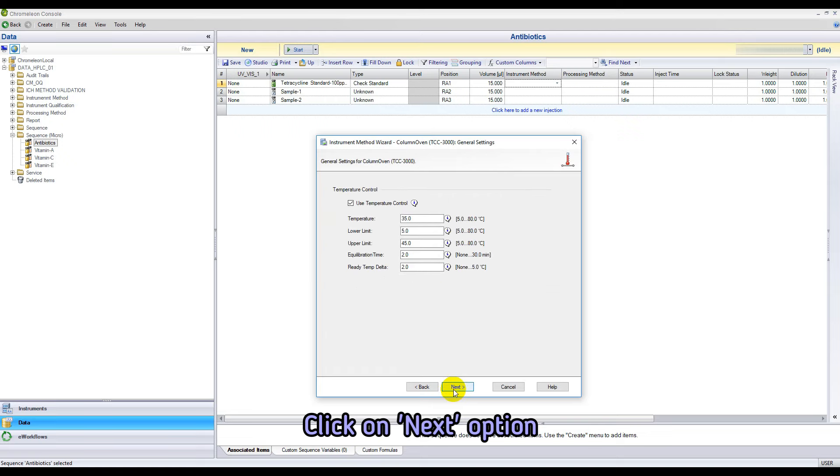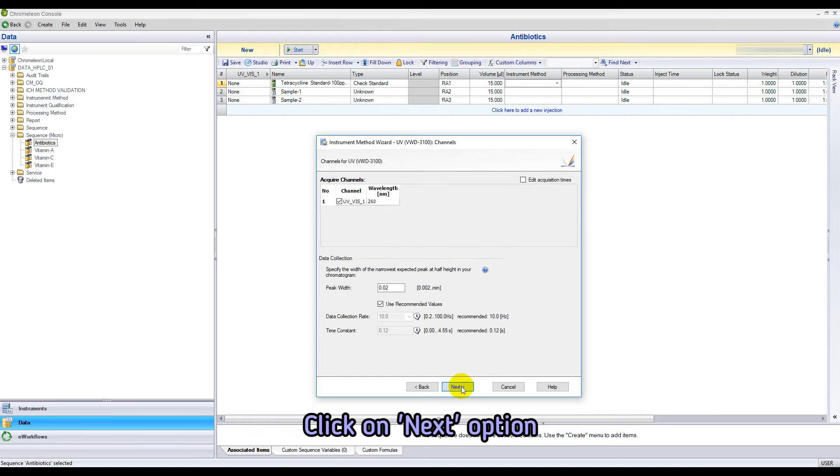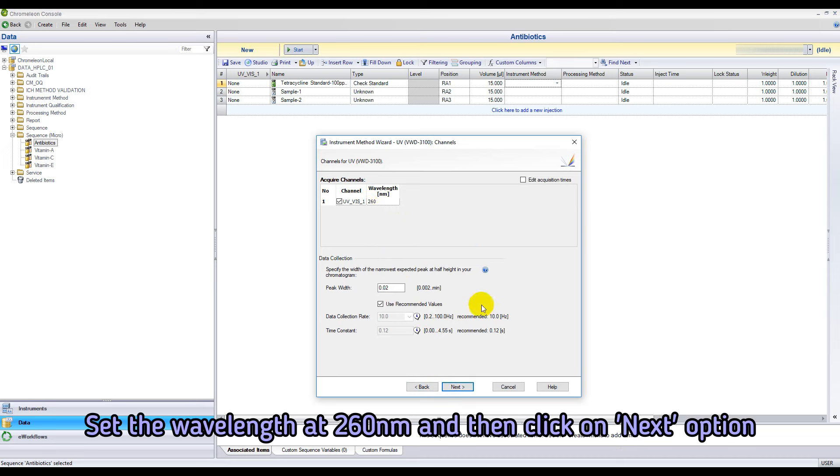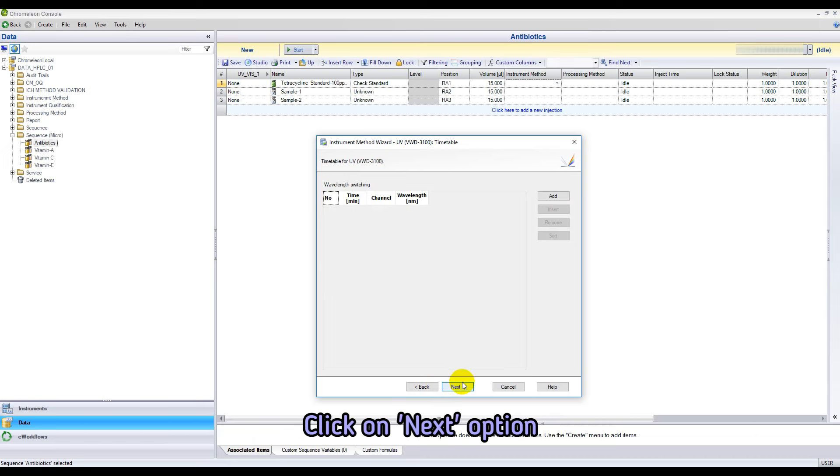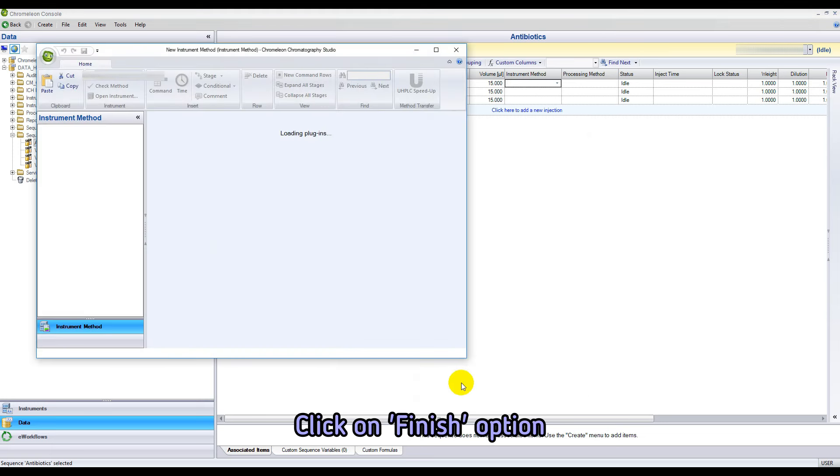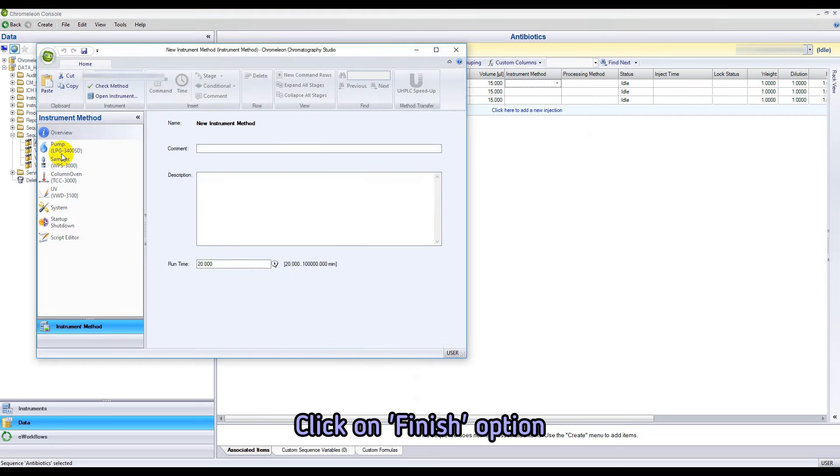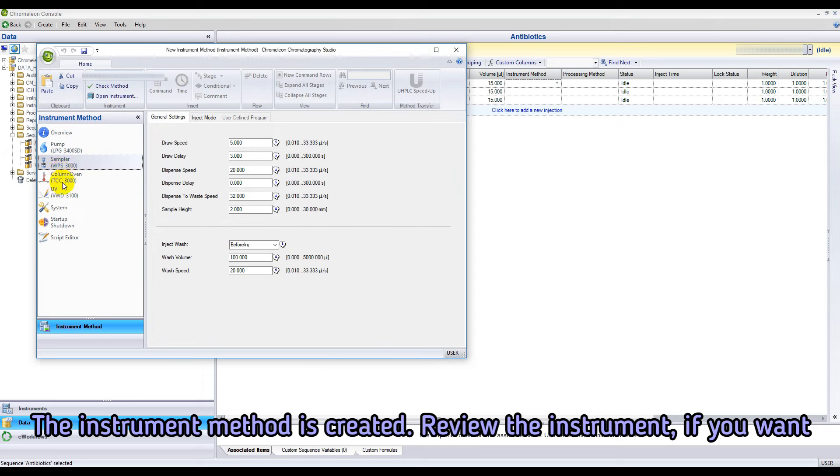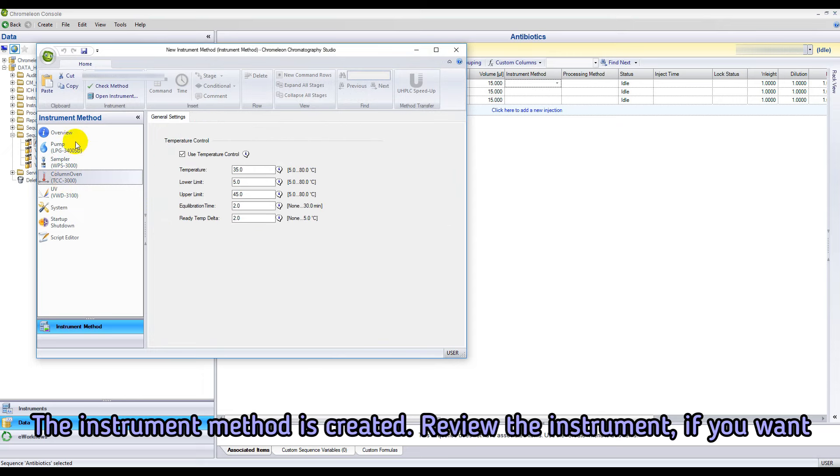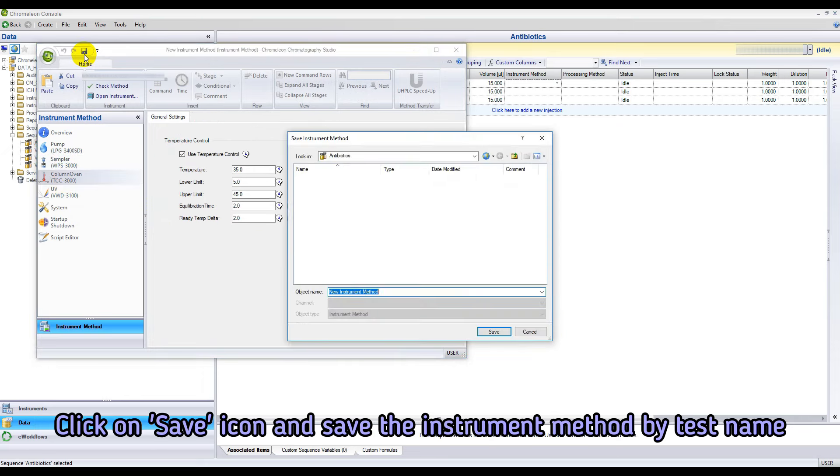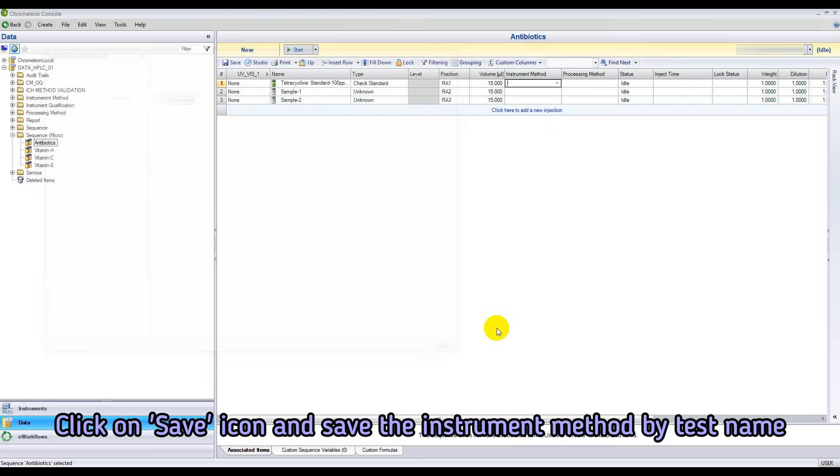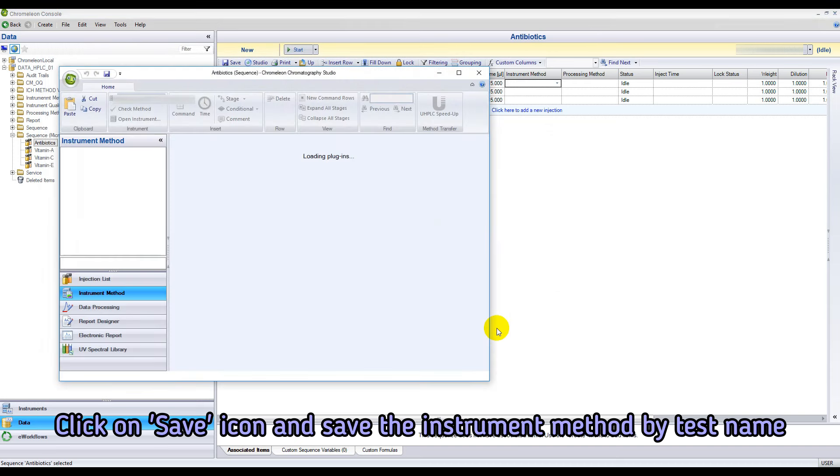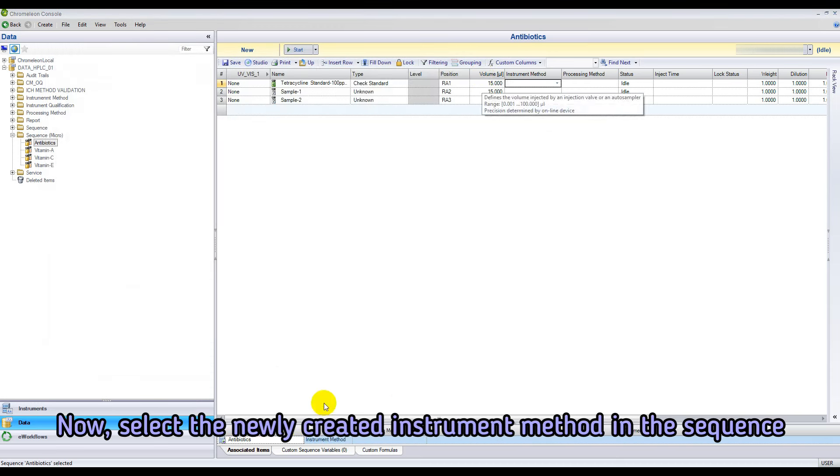Set the column oven temperature at 35 degrees Celsius. Set the wavelength at 260 nanometer. The instrument method is created successfully. Review the instrument method if you want. Click on save icon and save the instrument method by the test name.